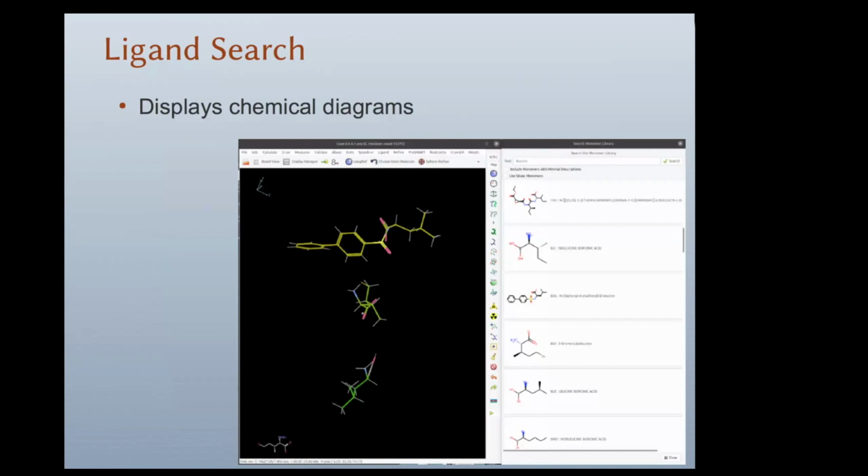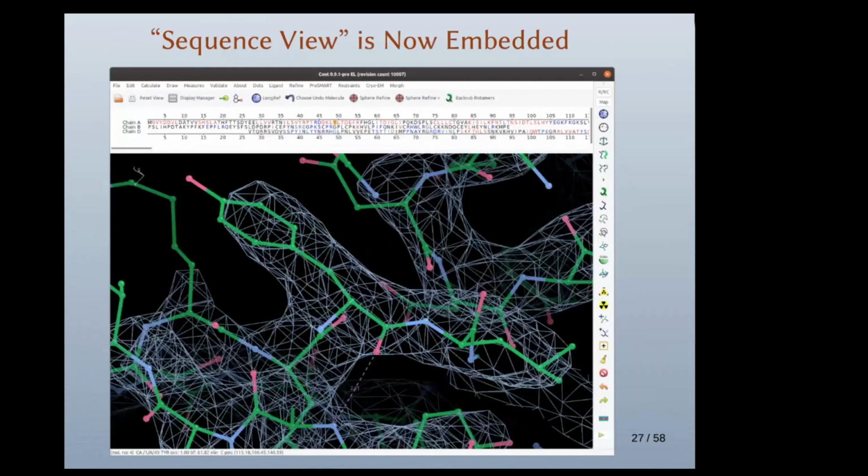So it turned out to me, without going into too much detail, that Coot was not used by Coot users, especially more recent PhD students, in the way that I expected them to use it, and they were quite resistant.